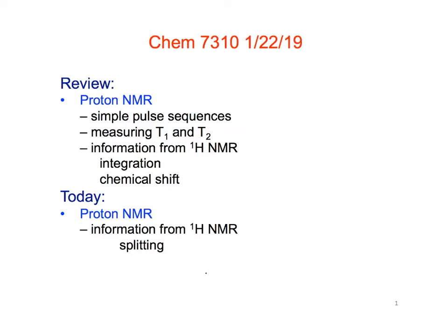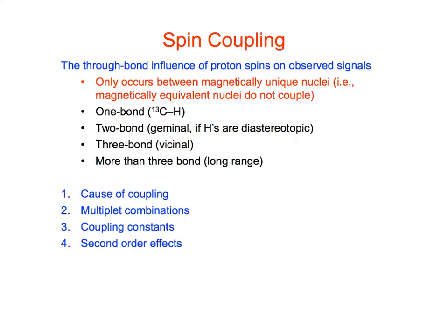Okay, so today we're going to spend our time mostly on this third piece of information that we can get from the spectrum, which is the splitting patterns. I know we've talked about chemical shift and integration already. So let's take a look at some general things about this.